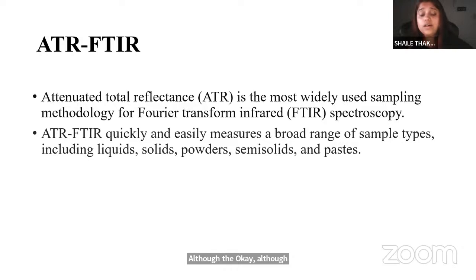Yes, so ATR FTIR is the most advanced technique of IR spectroscopy, although the entire technique is based upon the same principle of IR. We have studied the IR principle, right? Based upon vibration and rotation. This is also based upon vibration and rotation. Only the mechanism has changed, not the principle.